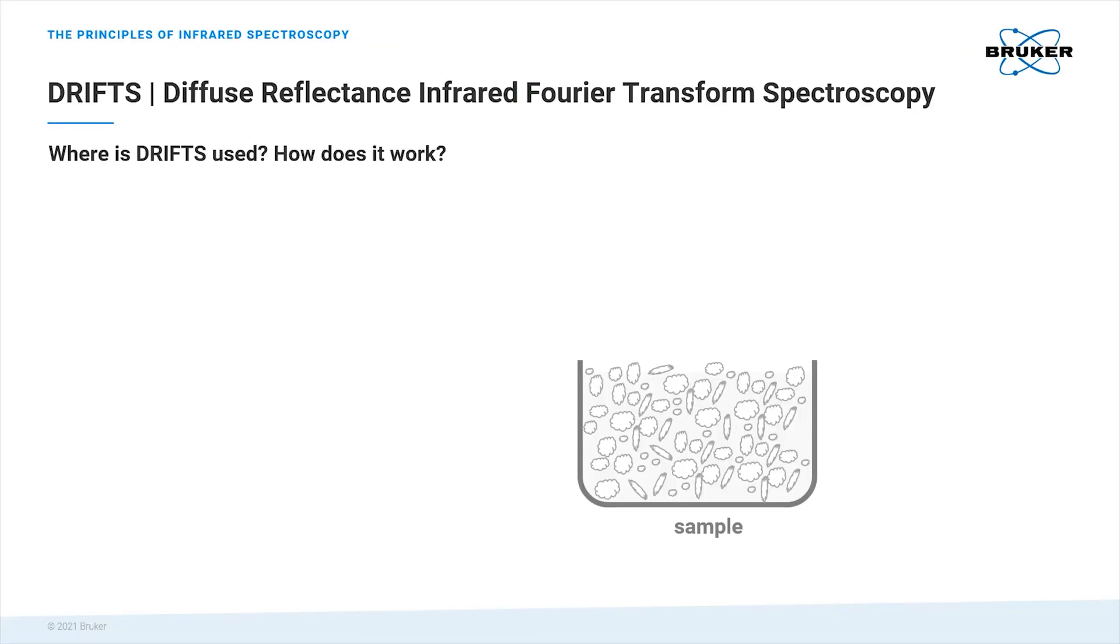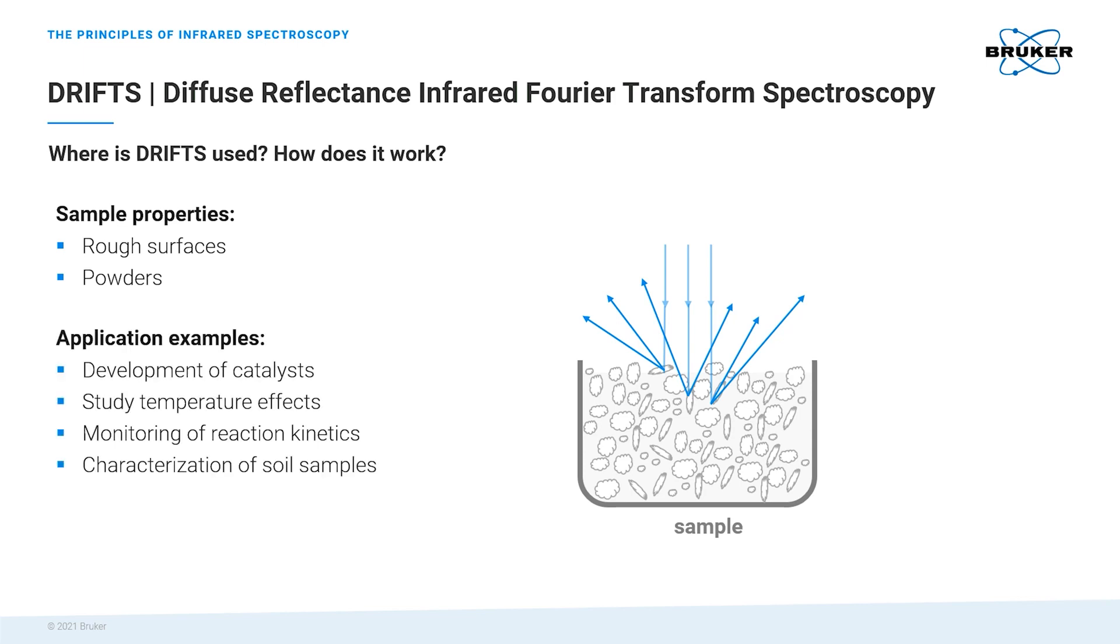During this demonstration, we would like to perform reaction monitoring using light diffusely scattered from the sample, the so-called DRIFTS configuration. This technique is particularly suitable for samples with rough surfaces and powders and is used in the development of catalysts, monitoring of reaction kinetics, and to study temperature effects or the analysis of soil samples, among other things.